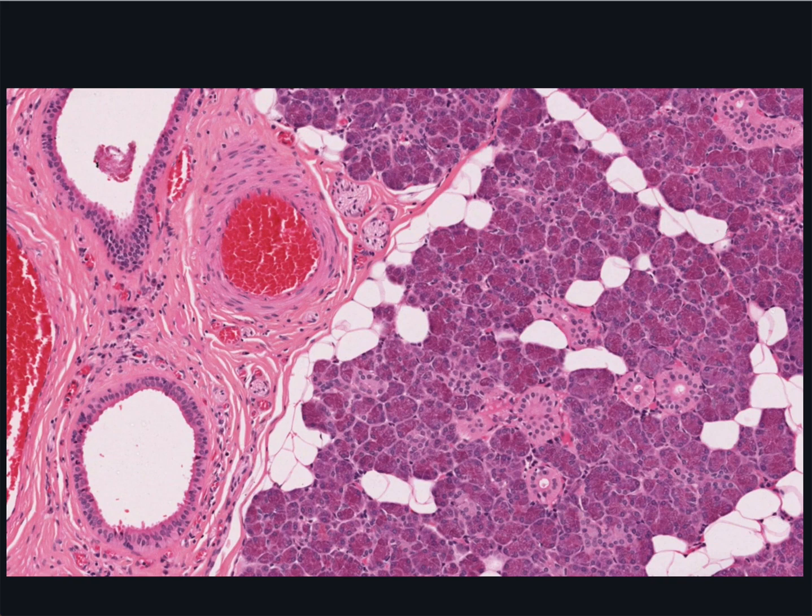Now let me just explain to you the duct system of this gland. Ducts are named in two ways, by location and also by function. Thus, locationally, as I can show you in this image, the ducts of the parotid glands may be interlobular, such as this large one here. And don't confuse it with this small artery. Or they may be intralobular, such as this one here, and here, and up again over here.